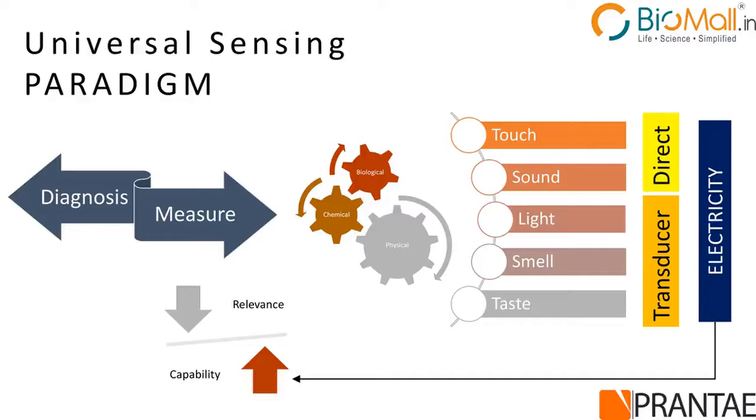The second kind of signal that we very often develop into any kind of diagnosis system is sound. The most often used technology is ultrasound, which you use not to measure sound but to do imaging. And the third, the most popular, which accounts for almost 90% of everything that we measure, is light. Almost all of biology is based on the capability of measuring light.